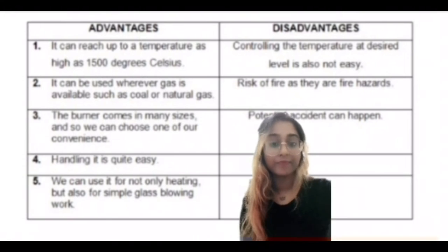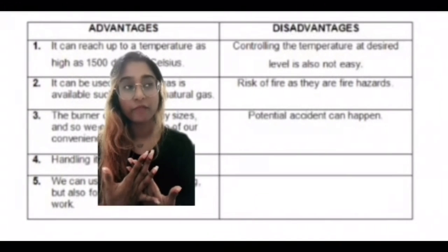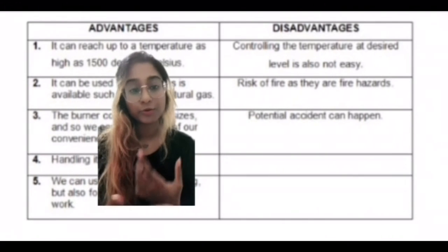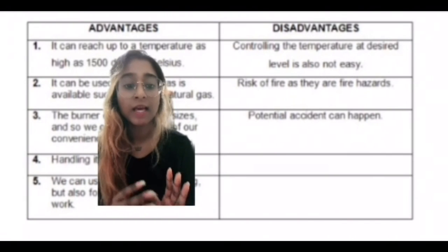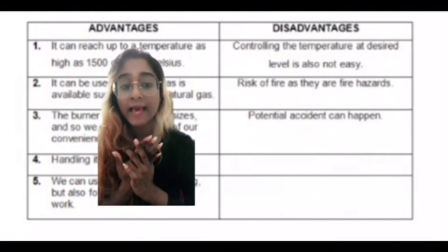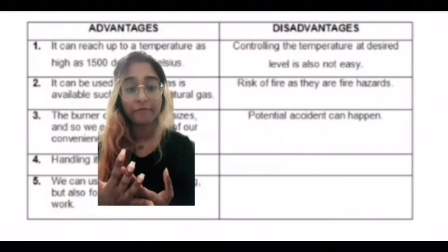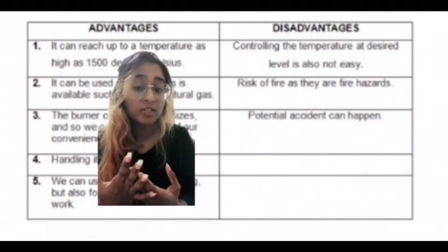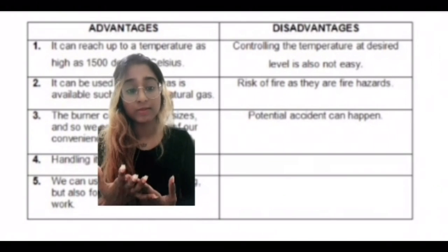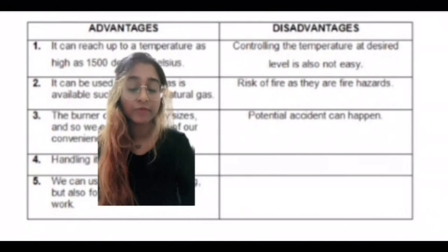The disadvantages of using a Bunsen burner is that controlling the temperature at its desired level is not easy. There is always a risk of fire hazards since they produce an open flame and burn at very high temperature. And hence, always be careful when using them to prevent potential accidents from happening.